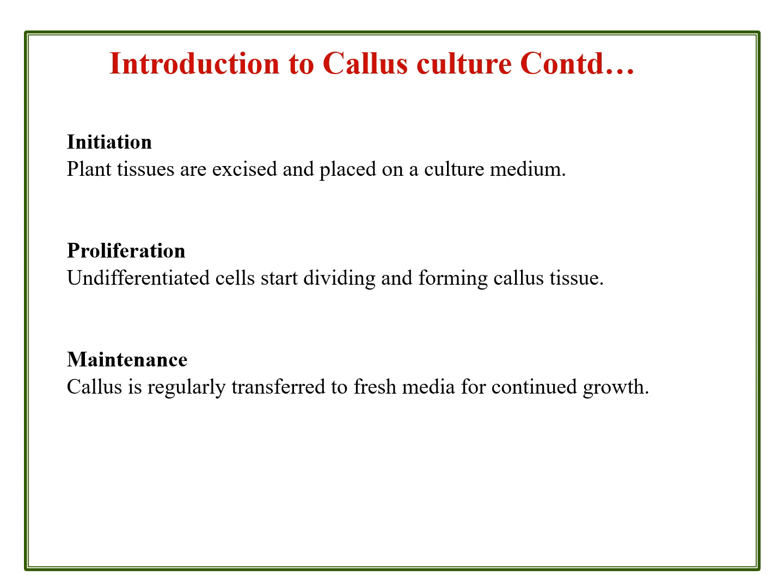Next, proliferation. After placing a plant tissue or an explant, generally an explant is defined as any excised portion from the mother plant. So these explants undergo changes within 15 to 30 days under these conditions, generally 25 degrees centigrade plus or minus 2 degrees centigrade, and 70 to 85% relative humidity.